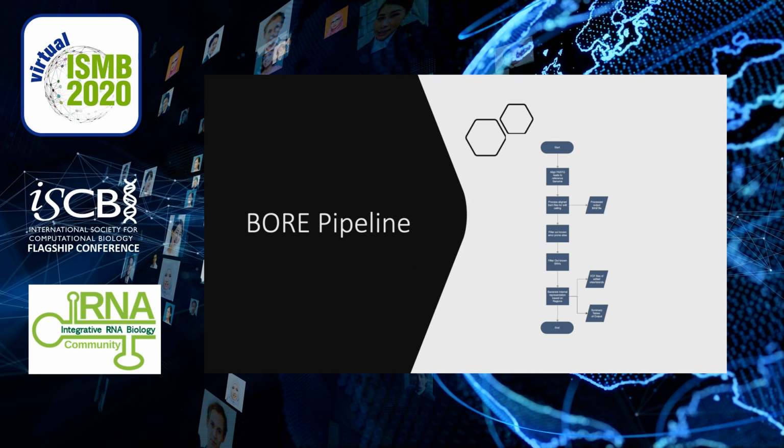This figure summarizes our technical workflow, which is not much different from the standard approach. We start with FASTQ files. We then proceed with alignment and variant discovery using standard pipelines. We then exclude known SNPs using existing databases like the 1000 Genomes Project and dbSNP. This is then followed by several stringent filters so that the resulting list of variants is most likely to contain edits. This is then output as VCF files and summary tables.